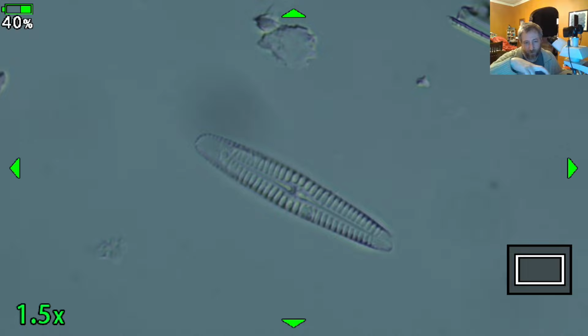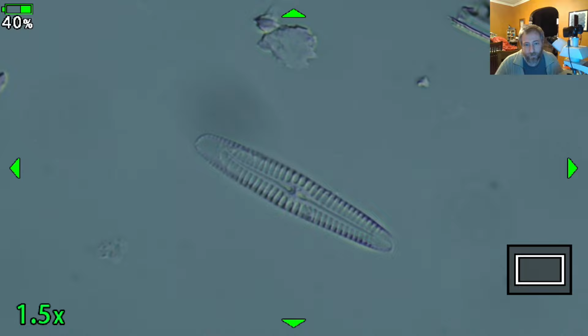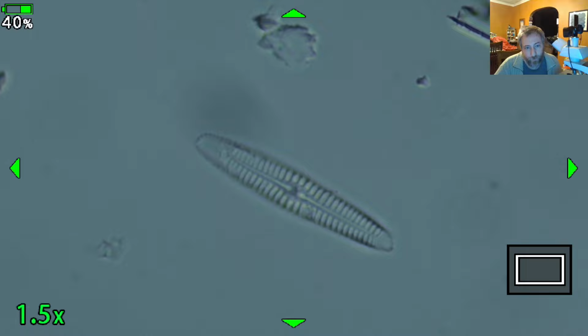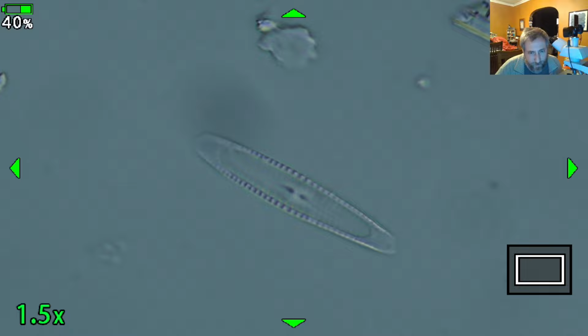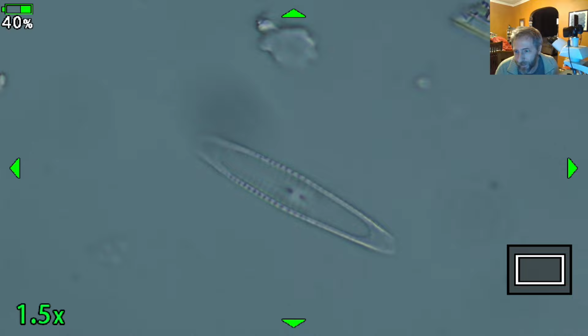And then it also has a foot pole and a head pole, just like the Gomphonema that we were looking at. It has a big side and a small side. And the bottom part has an apical pore field, the same as the giant one that we were looking at. But we only saw this one in girdle view before, and this is what it actually looks like in the raphe view. And if I could focus through it and the other valve were completely visible, which this one, it's slightly dissolved, we'd be able to see that it has tiny little short raphes at the top and bottom. So it's kind of a little weird guy.